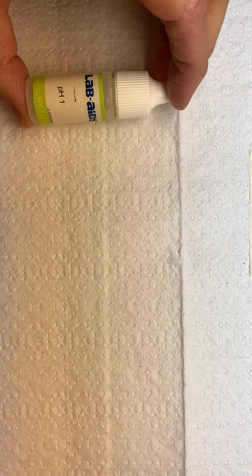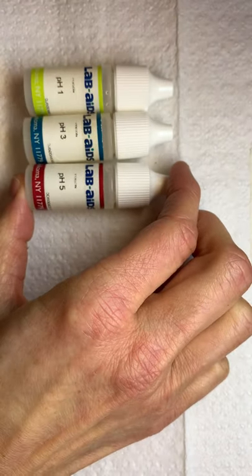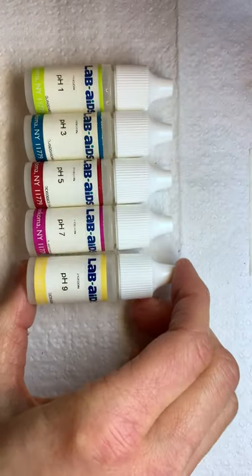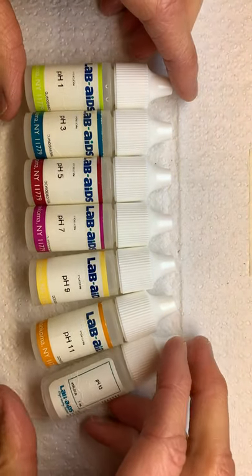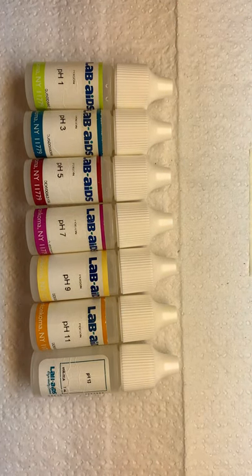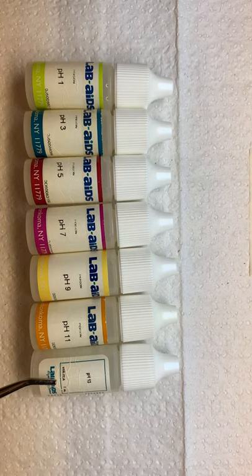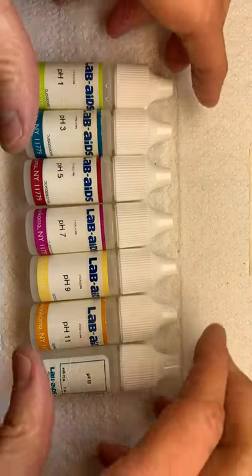I have a range of pH to test. You'll notice that the numbers are not 1 to 14 per se — they are the odd pH numbers, as in 1, 3, 5, 7, 9, 11, and 13. So we're going to test those odd numbers — 1, 3, 5, 7, 9, 11, and 13 — and that will cover our 0 to 14 pH scale.